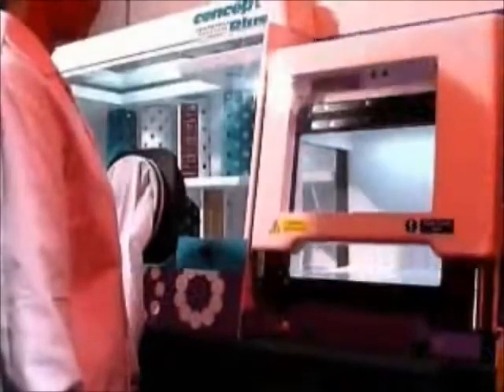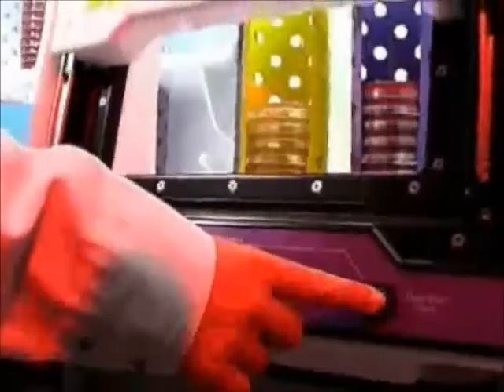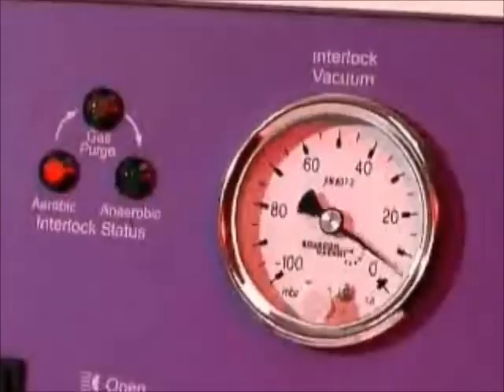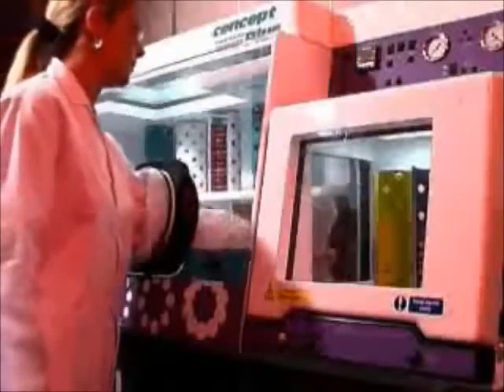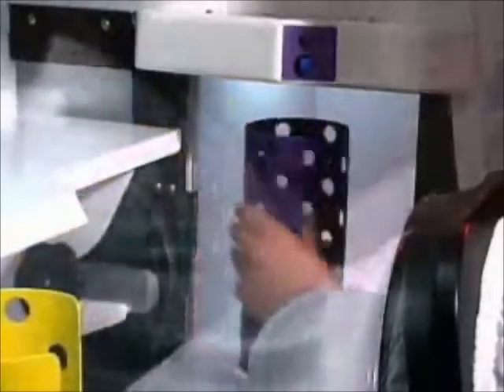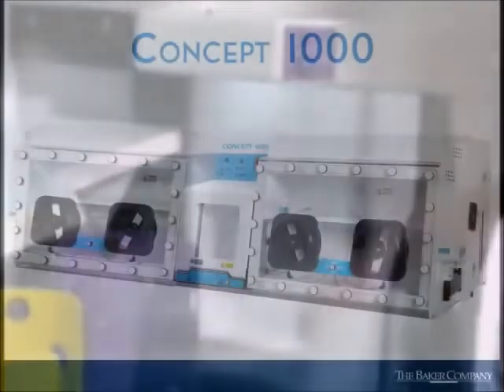The Ruskin Concept Plus anaerobic workstation allows the transfer of large bottles, flasks, and small equipment through the generous size front-loading interlock. Designed to meet the requirements of larger laboratories, the interlock processes up to 100 plates in just 5 minutes, but also offers an economy cycle to introduce smaller loads in a fraction of the time. The fully automated interlock features class-leading one-touch operation and easy access for loading and unloading with a convenient pull-out shelf.